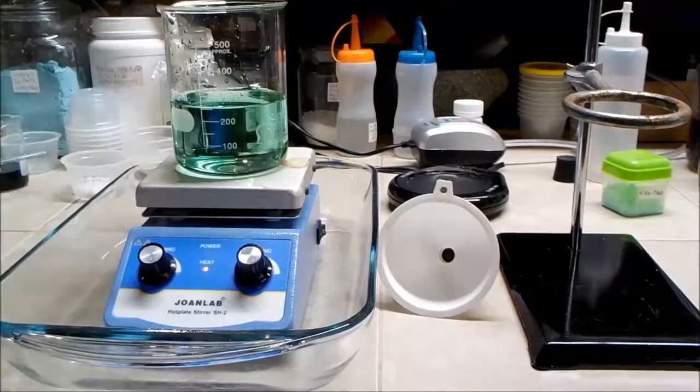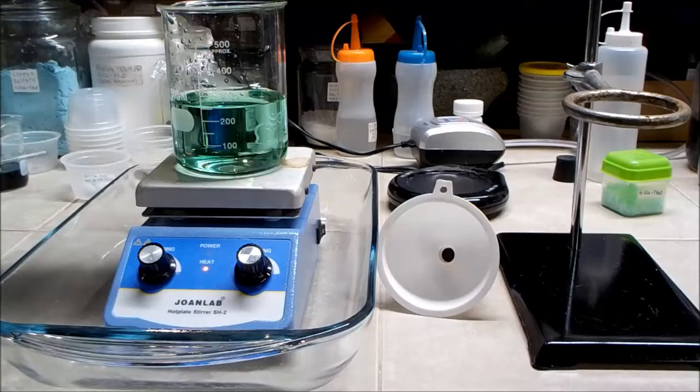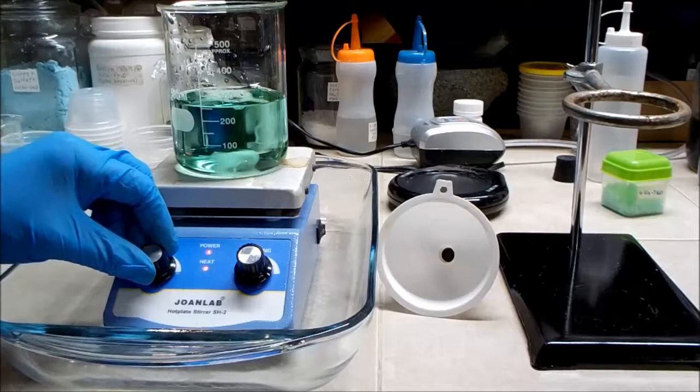And I am going to put in a stir bar. Maybe that'll help it evaporate more quickly and also prevent bumping.